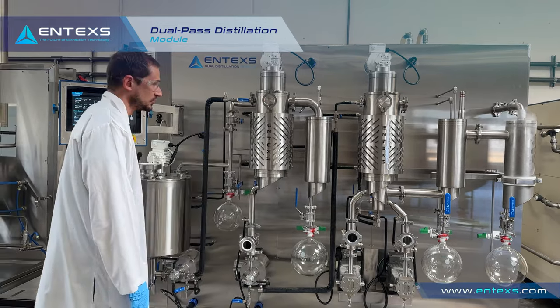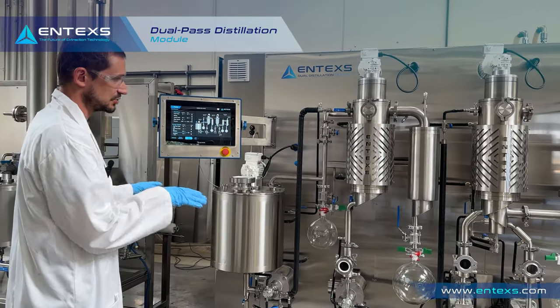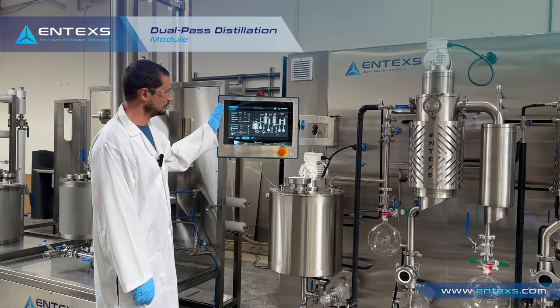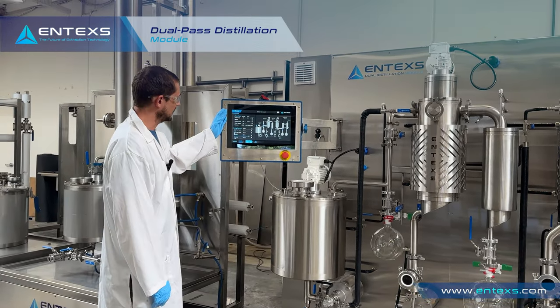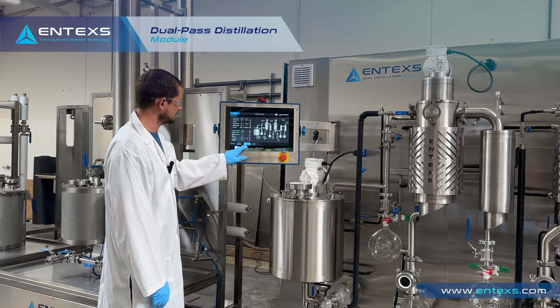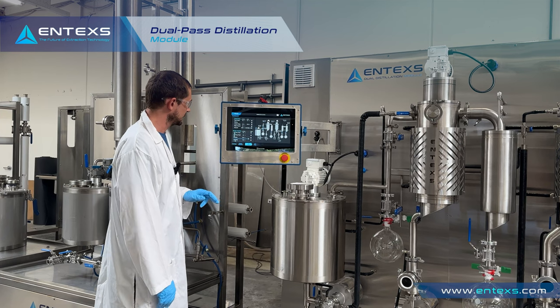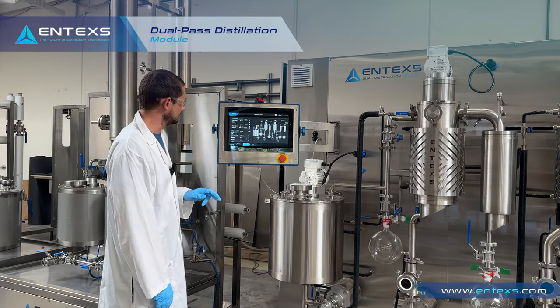Today we're going to run through how to operate the system, how to control the system, and how to get good clean product out. Everything on the system is controlled by our HMI. It's broken up into two stages: first pass and second pass. We're going to start with the first pass and starting up the system.